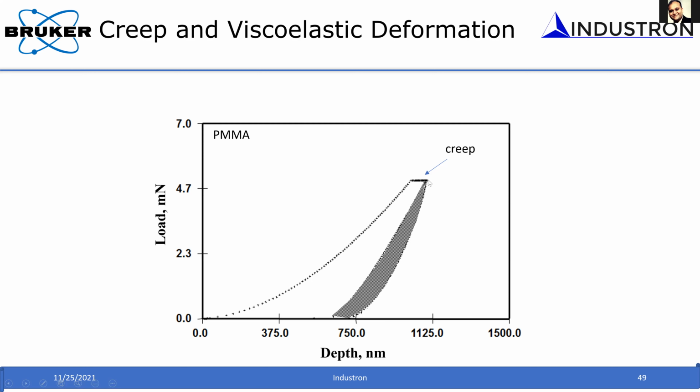That's why we were able to treat the unloading curve as an elastic curve and measure its slope to calculate the stiffness. But when you have a viscoelastic material, when you load and reload, it will not retrace that curve. So it is no longer elastic. It is almost like a viscoelastic response, and that's why you see this hysteresis.